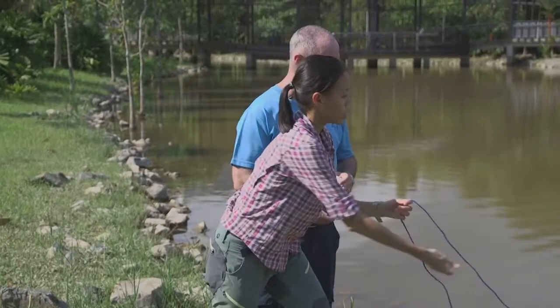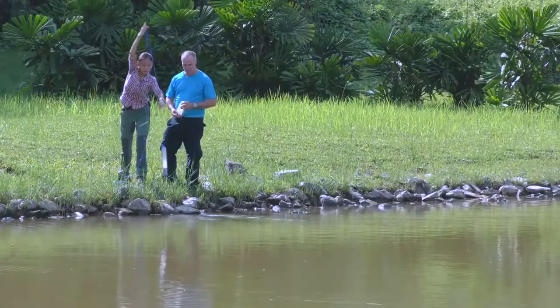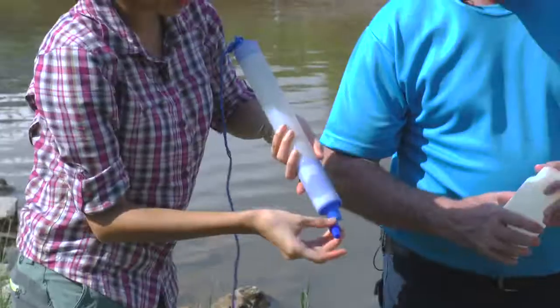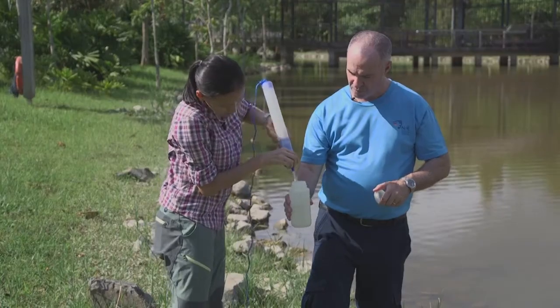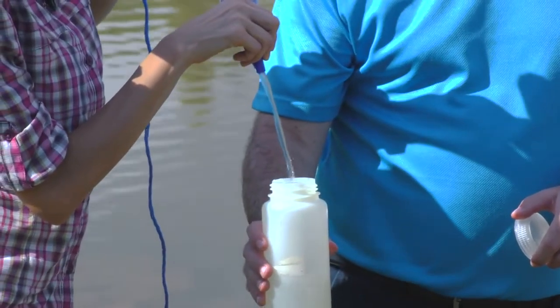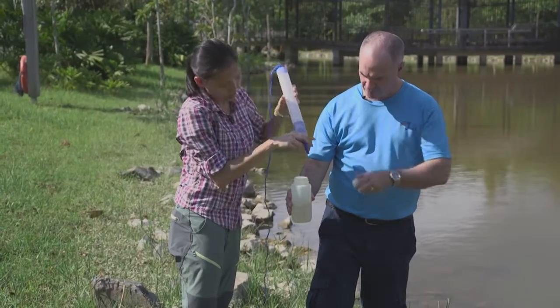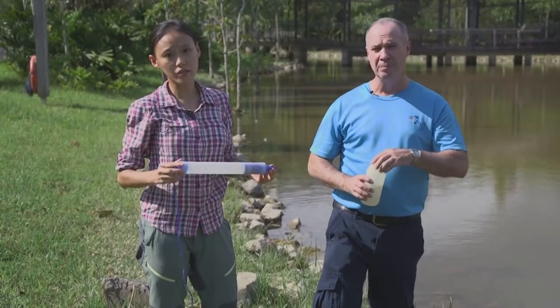As you draw the baler in, be careful not to drag it onto bottom sediment or bang into any obstructions. Once you retrieve your baler, insert the tip to release the stop ball and drain your sample. As with the dipper, remember to rinse your baler 3 times before you use it for the actual sample.